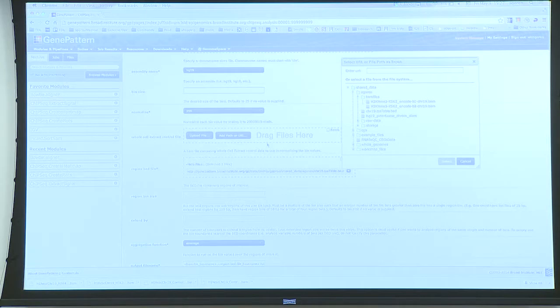So the bin size tells you how you disperse the data. If you take a bin size of 10 kb, they're not going to be so sensitive, so they're going to count everything. If you take 25, the resolution is pretty high. So this is the way to imagine it. 25 base pairs or 100 wouldn't make a lot of difference.